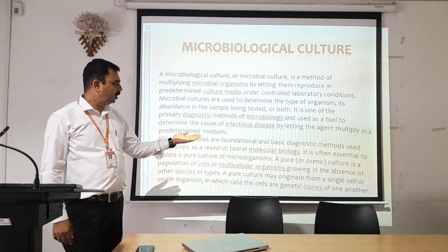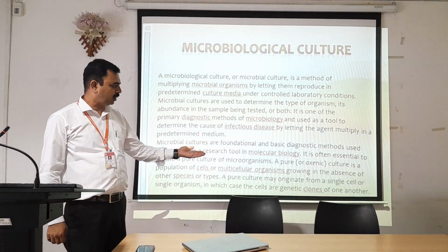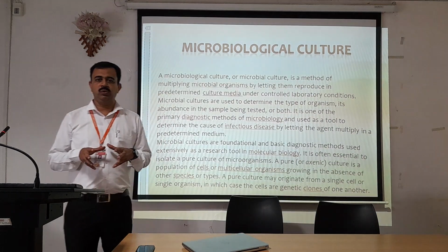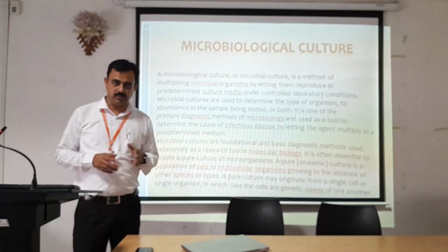In terms of molecular biology, isolation of pure culture is a key method. A pure axenic culture is a population of cells or multicellular organisms growing in the absence of other species or types. What can we define a pure culture to be? Pure culture is something which is free of other organisms.